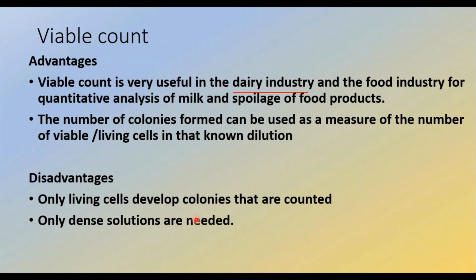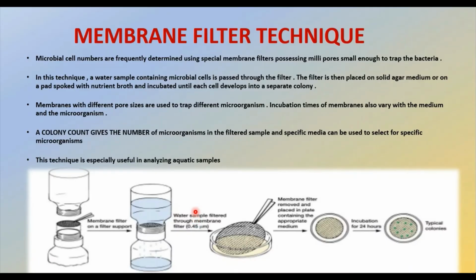Then moving to the next one, that is the membrane filter technique. The membrane filter technique is an effective and most widely accepted technique for testing fluid samples for microbiological contamination. Not only that, this technique involves less preparation than many other traditional methods.